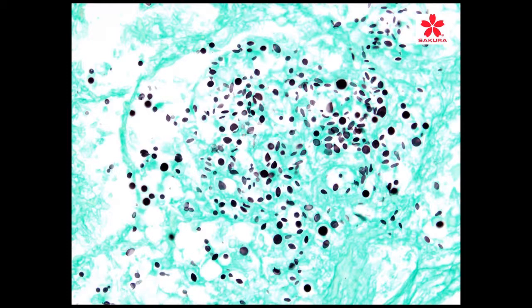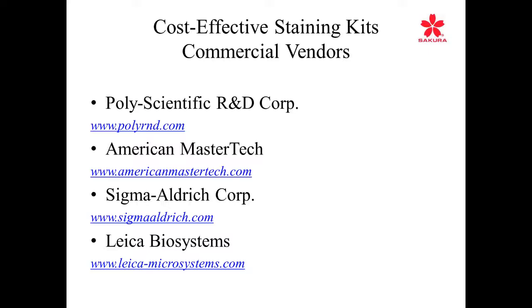But I realized later on with the instrumentation that came out years ago that they were able to achieve this optimal staining. And so I think that there is something definitely to be said on the positive for automation when it comes to silver staining and any other staining technique. Now, you can be using automation for these, or there are other cost-effective methods of doing these stains.